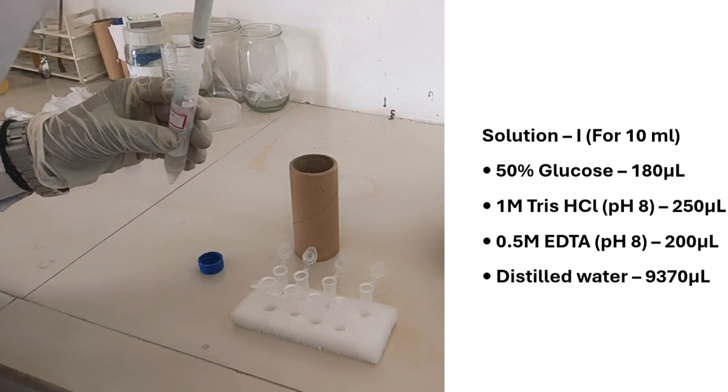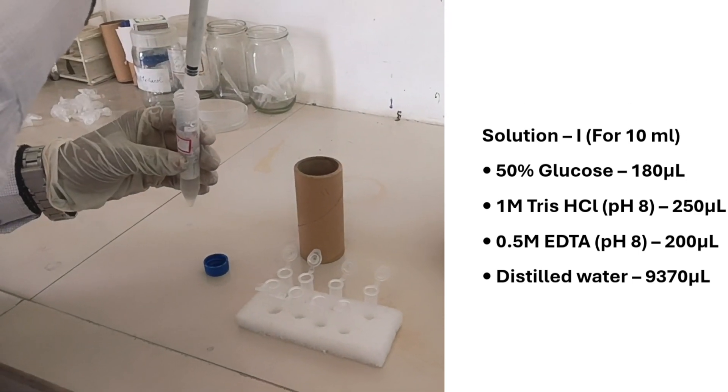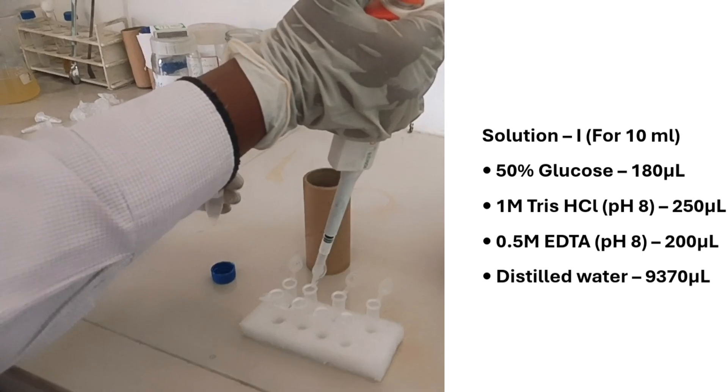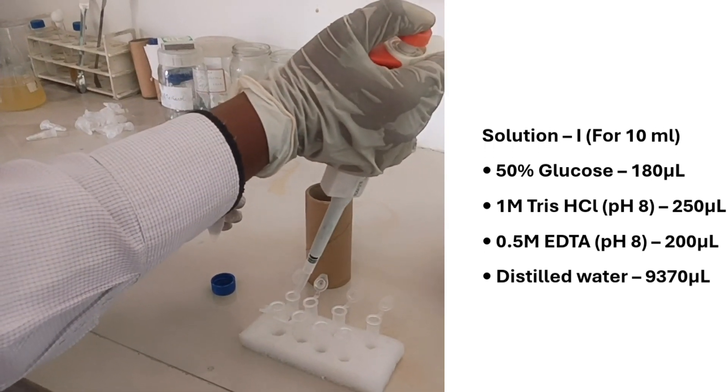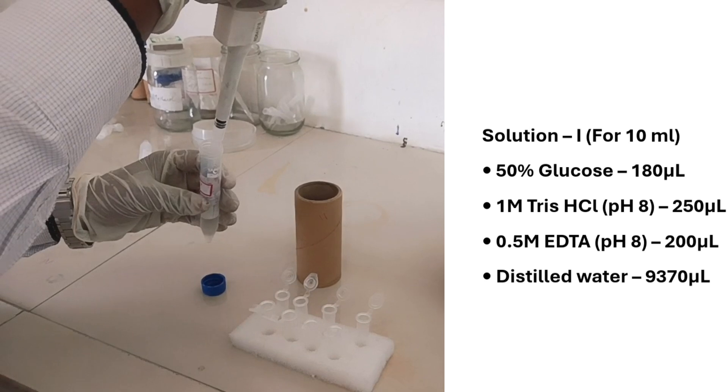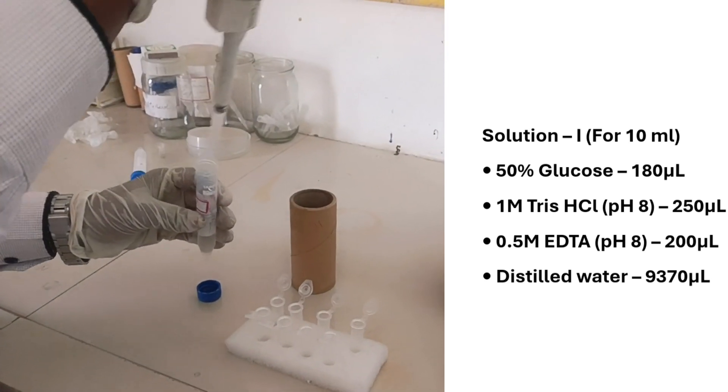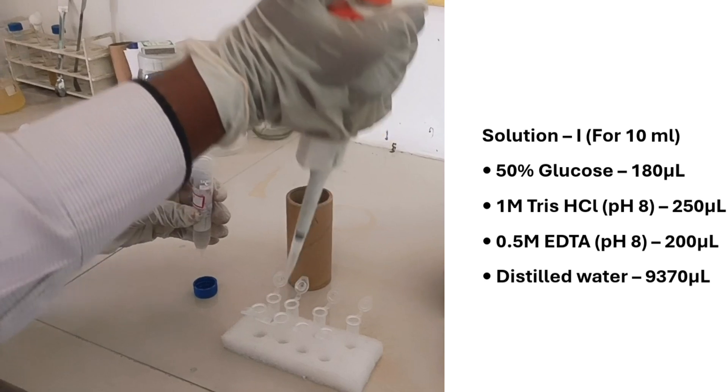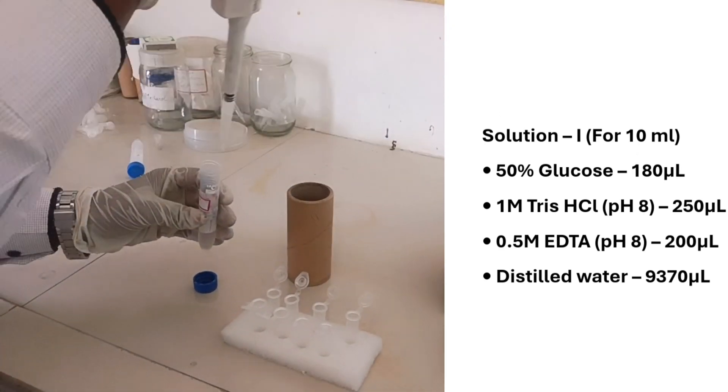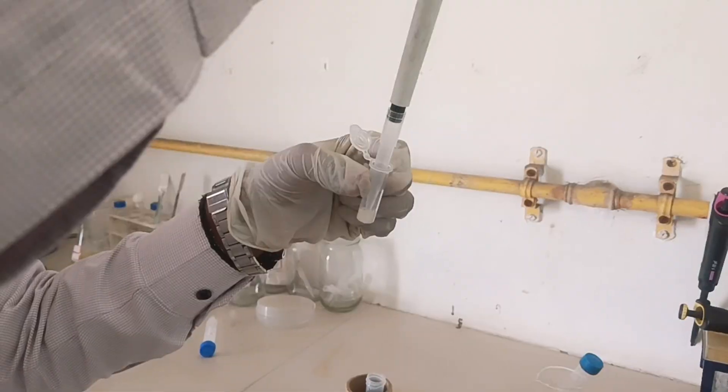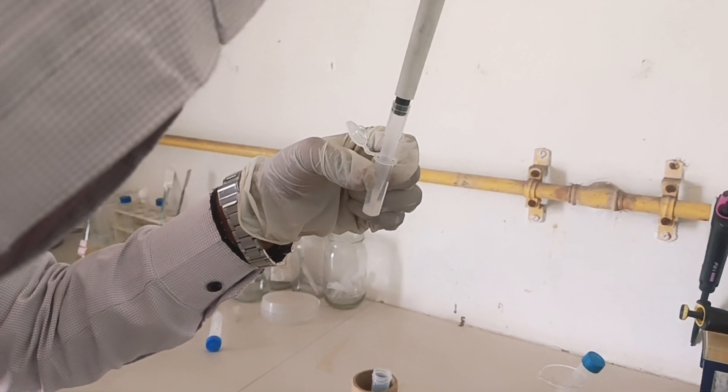After centrifugation, add 200 microliters of chilled solution 1 which has been prepared for 10 ml by adding 180 microliters of 50% glucose, 250 microliters of 1M Tris-HCl pH 8, 200 microliters of 0.5M EDTA pH 8, and 9.37 ml distilled water. After adding solution 1, resuspend the pellet using a pipette.